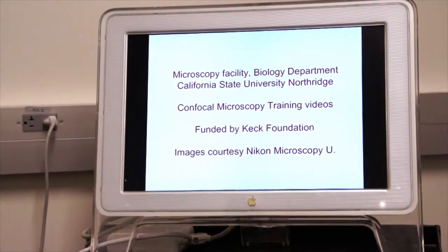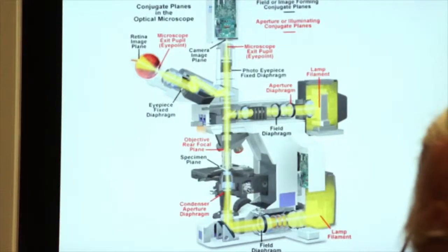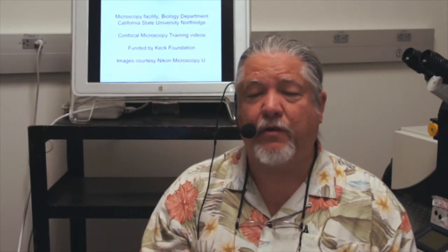You'll see the screen behind me which has text on it, and you will be noticing some figures on that monitor. Those figures are courtesy of Nikon Microscopy University, and it's a wonderful website. If you Google Nikon Microscopy University, you'll find a whole host of interactive tutorials and other information related to microscopy. So we want to thank them for allowing us to use their figures during this presentation.